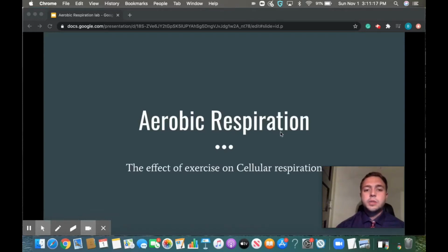Hey everybody, it's Mr. B here today, and I am here to demonstrate and show you guys how we can look at and observe aerobic respiration specifically within our bodies. The way we're going to do that is by observing the effect of exercise on cellular respiration.